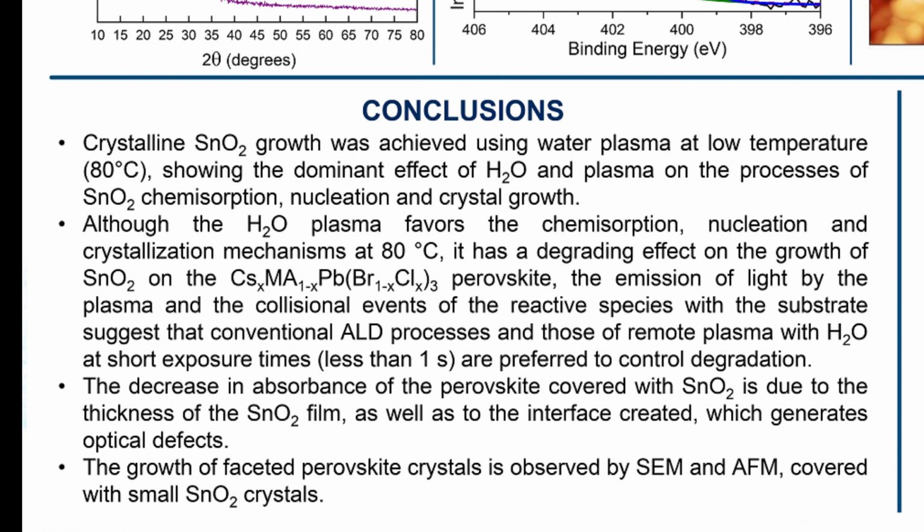The growth of faceted perovskite crystals is observed by SEM and AFM, covered with small tin dioxide crystals.